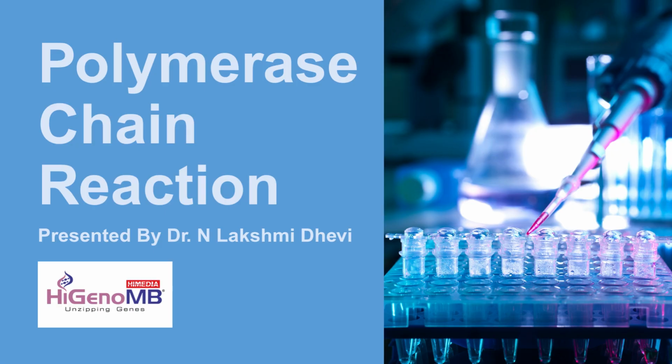So this crash course in molecular biology is organized by HiGenoMB, keeping in mind the important technologies for the students to be well aware of in molecular biology. There are 8 sessions in this crash course, and the first session is on PCR and real-time PCR, which I will be taking today.